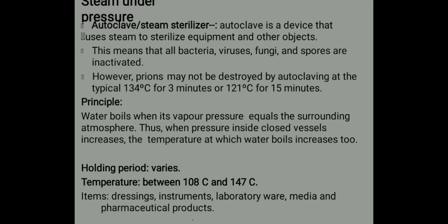However, prions may not be destroyed by autoclaving at typically 134 degrees Celsius for 3 minutes or 121 degrees Celsius for 15 minutes. Talking about the principle, water boils when its vapor pressure equals the surrounding atmosphere. Thus, when the pressure inside a closed vessel is increased, the temperature at which water boils increases too.